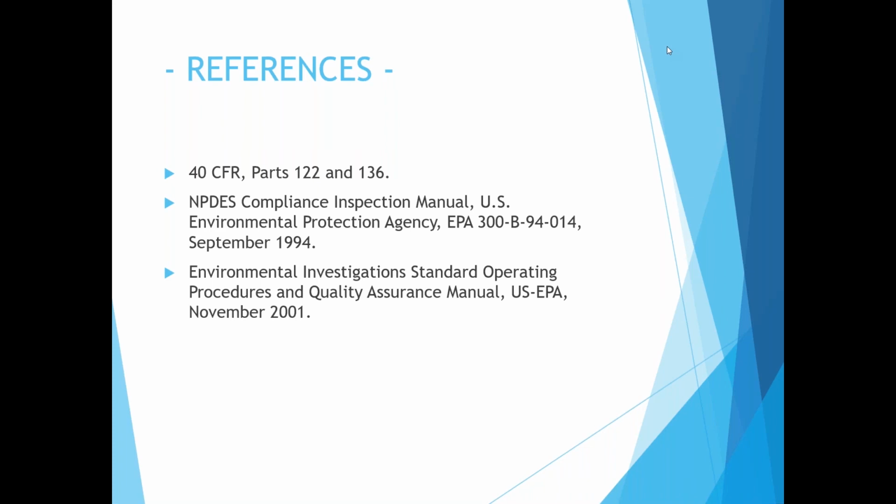So if you had an eighth inch bar screen, I would say that would interfere. But again, 1/4 inch or larger, you should be fine.